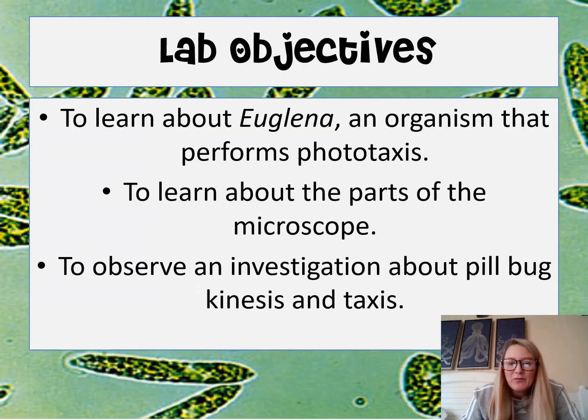So our objectives for this week's lab: number 1, learn about Euglena, an organism that definitely uses phototaxis. Then you're going to be learning about the parts of a microscope, and then lastly, you're going to be learning about pill bugs and how they respond to different things in their environment.